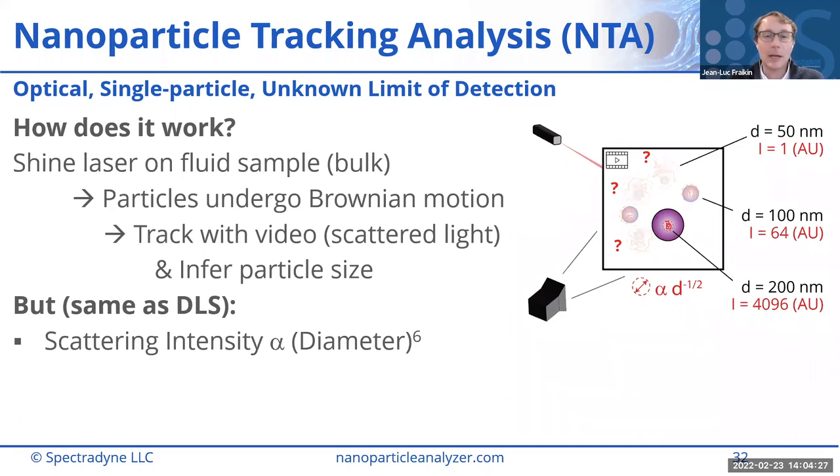That's a great question, and I think what you're asking is how does shape affect the particle measurement, and are there any practical considerations for measuring oddly shaped particles? Fundamentally, our technology measures the volume of the particle and reports an effective spherical diameter.